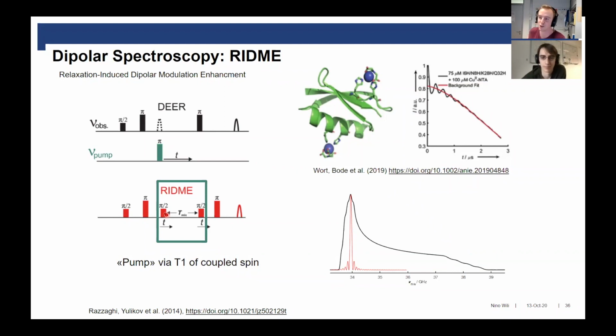But of course, often the choice is also biochemical and not spectroscopic, so you cannot really distinguish the two. So if you have a specific example or something, maybe I can give more details. But okay, so talk to Nino for all your EPR questions in specific systems.